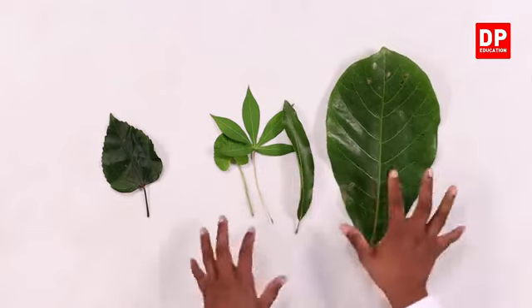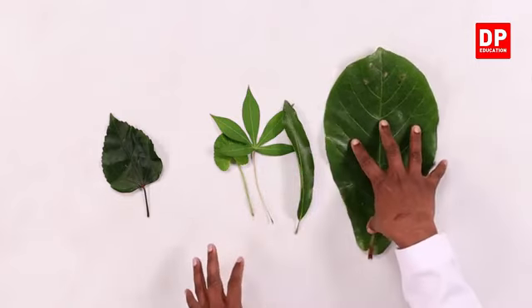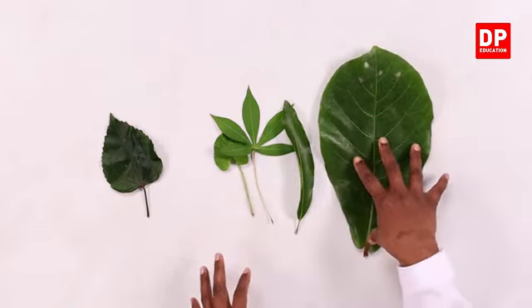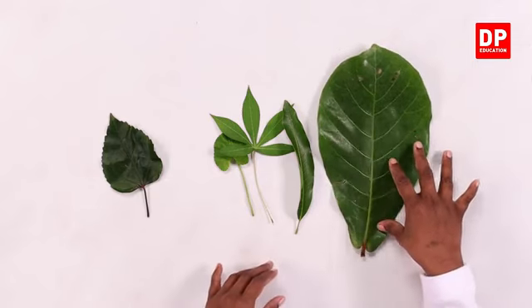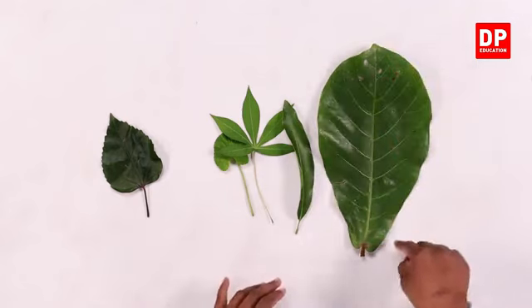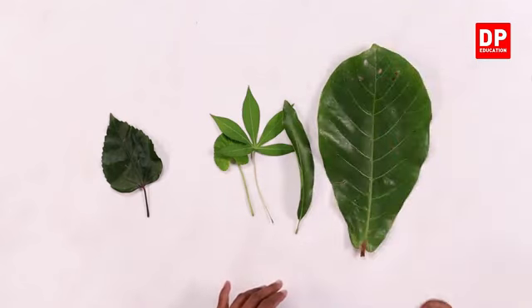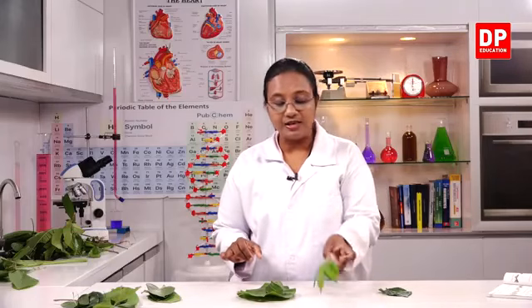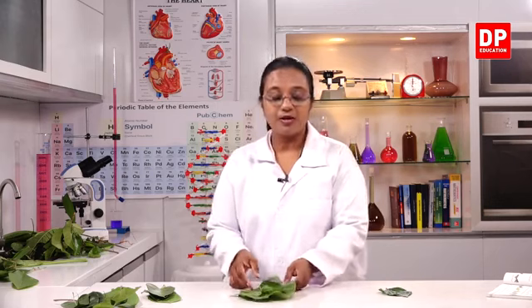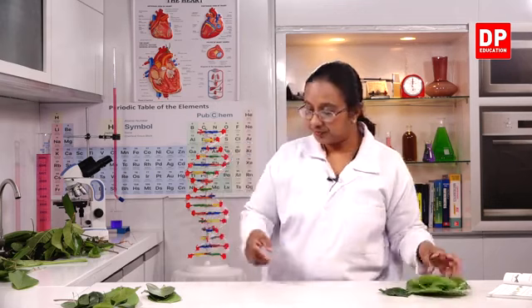Now compare all these four leaves. This is a very large leaf, known as Kottamba in Sinhala and Kattapu in Tamil. Here you can see a very broad, large leaf blade. So from that you can understand that different leaves have different shaped leaf blades.